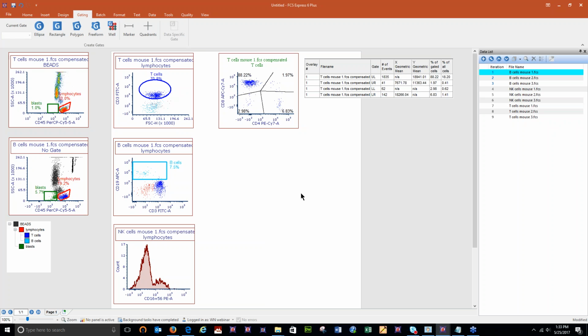Okay. All right, so let's create a marker. So I can do that from the gating tab as well. So I'm going to put a marker on this plot. All right, and now that marker is obviously highlighting the positive population here. Let's create a linked marker, because that's something that can be kind of useful for all of you as well.